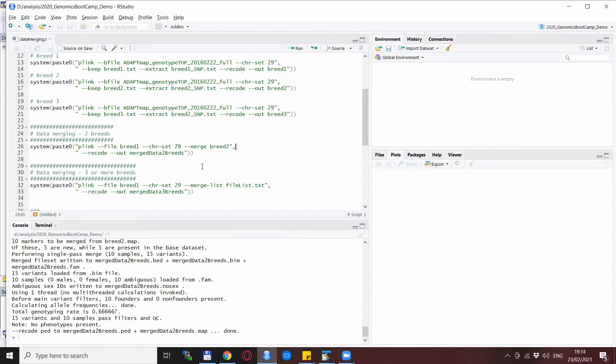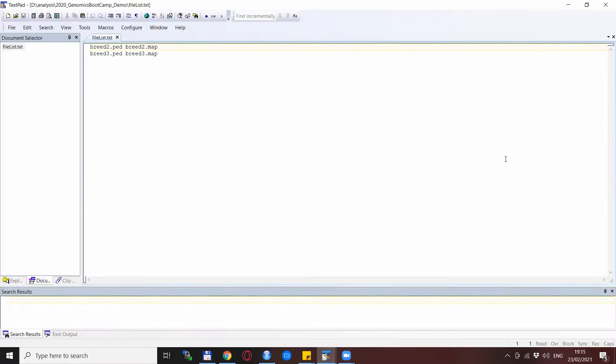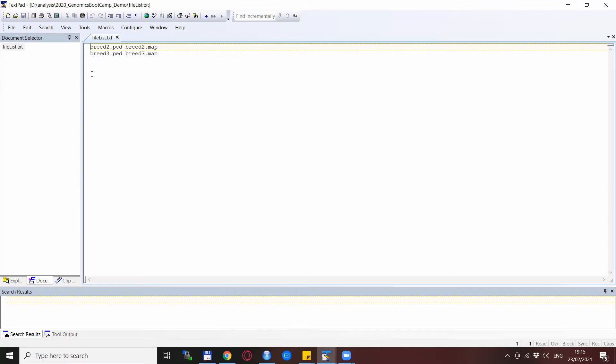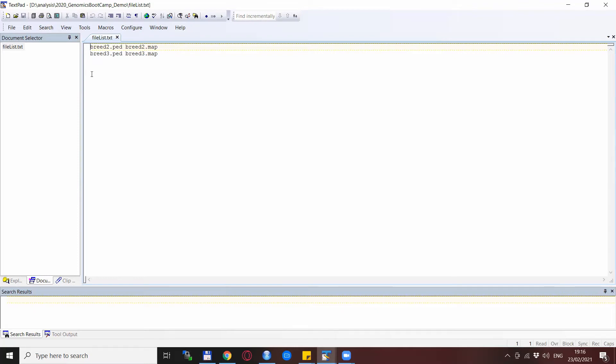This takes as a variable a filename which I call file list here, and this is how the file looks like. You see there are the filenames, the ped and map filenames of the other two files that I need to merge together with breed one, because breed one is specified in the --file statement, and then the job is done in one line and in one step. So let's run this and see what happens.